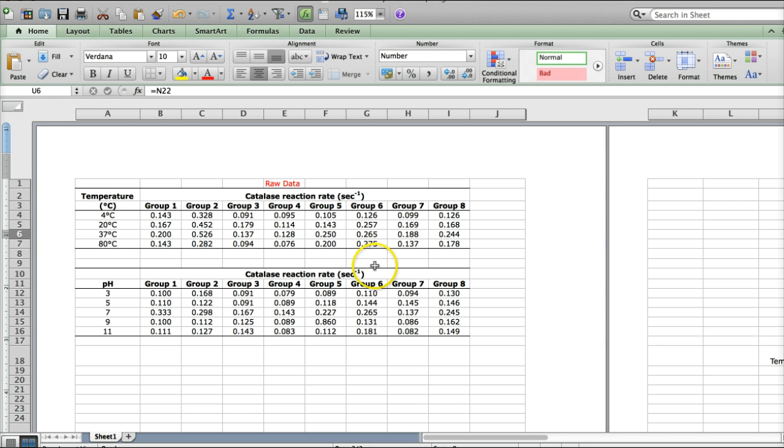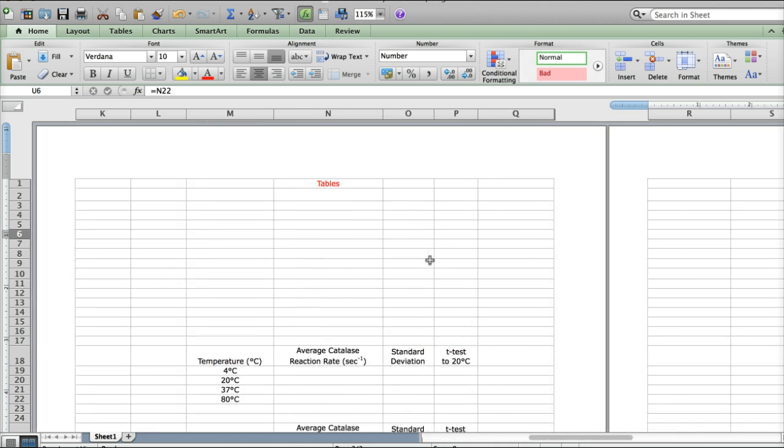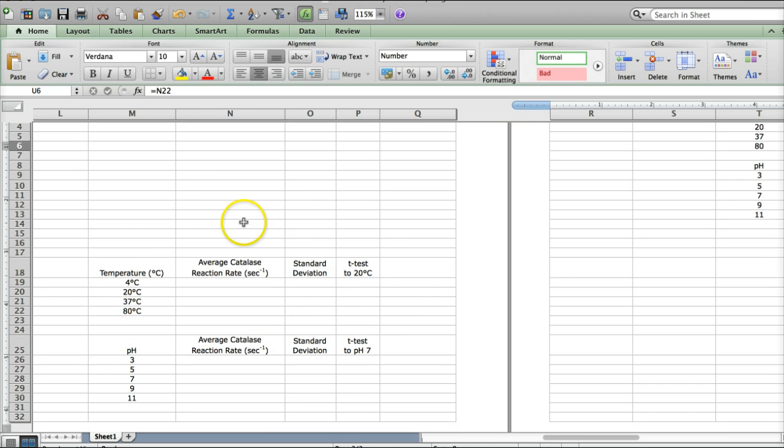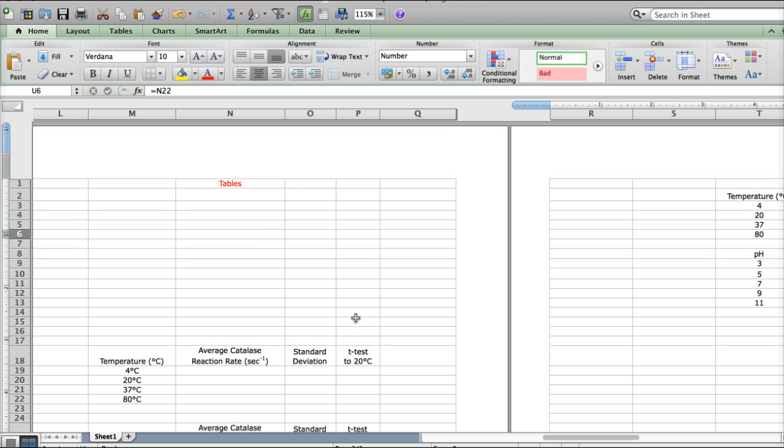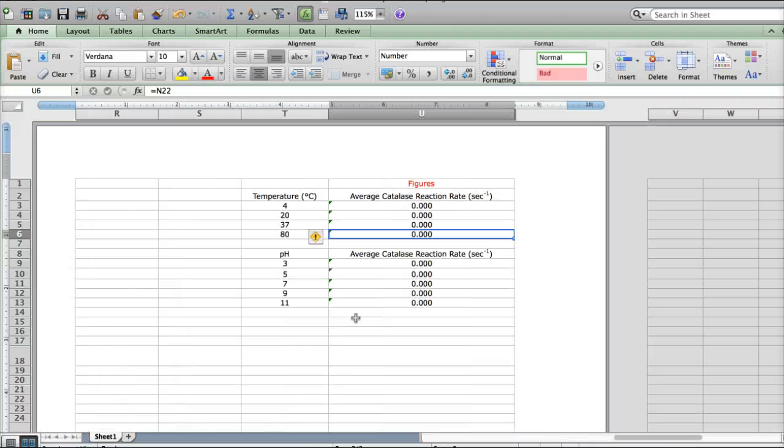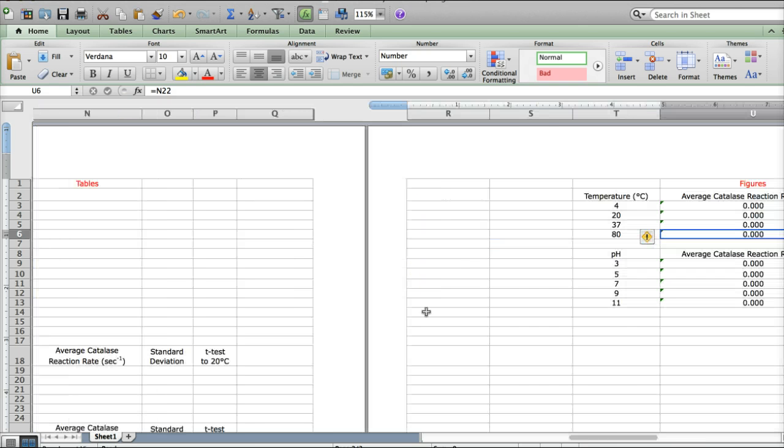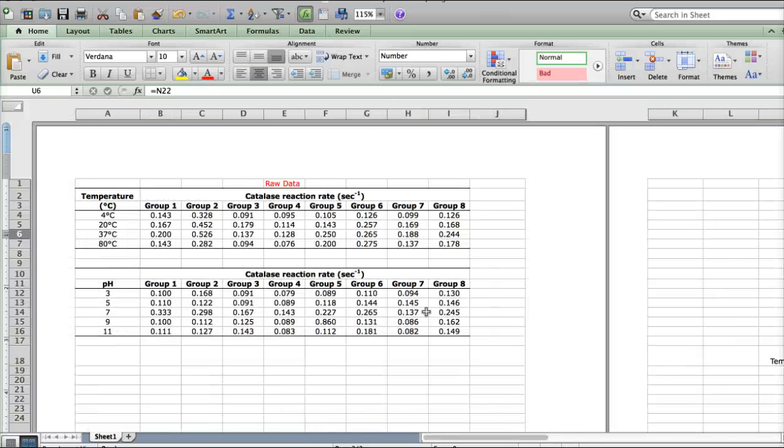So this is the data file that you will download from the Blackboard site. Once you open it up in Excel, you'll see that there are three pages. The first page has the raw data. The second page is where you'll be making your tables. Down here at the bottom, it's all pre-formatted for you and you'll just be adding in the numbers and doing a couple more things. And then the third page is where you'll be making your figures. This will collect some information from your tables and then facilitate making your figures.